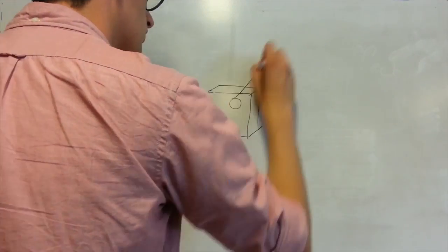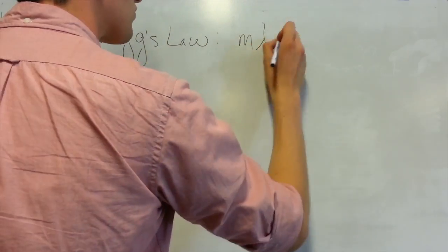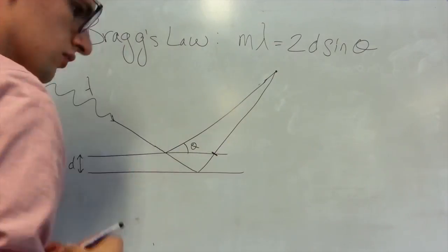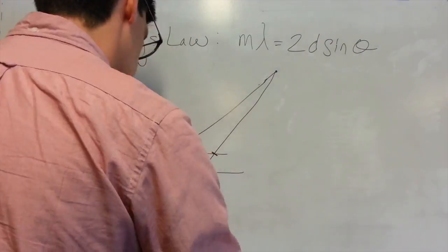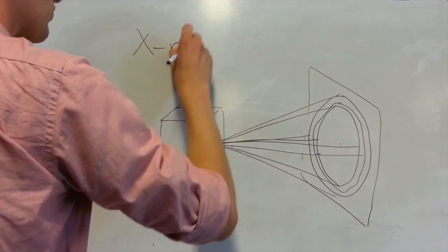X-ray diffraction is employed to shed light on the minuscule scale of the local piezoelectric effect. Bragg's law tells us that a crystal plane will diffract an incident beam if it forms a precise angle theta with the beam. In a bulk material, there are many such planes, and the diffractions culminate in a series of concentric circles on the measurement plane.